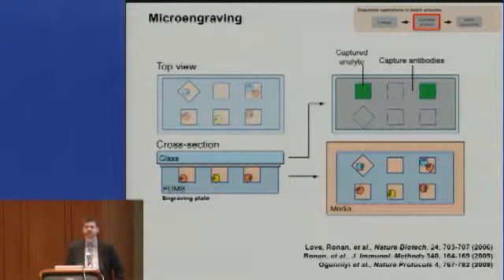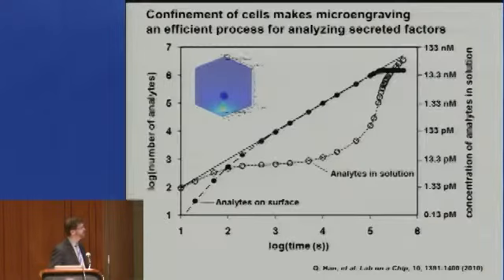Now, one of the things about being able to put this into a small container is that we don't just have to measure whether or not a cell made an analyte. The conventional enzyme-linked immunospot assay provides you that type of information, but this confined volume of defined size allows us to do quantitative measurements of secretion from individual cells. Now, shown here is a model wherein we're looking at the rates of secretion of an individual cell. The theoretical line is shown here.